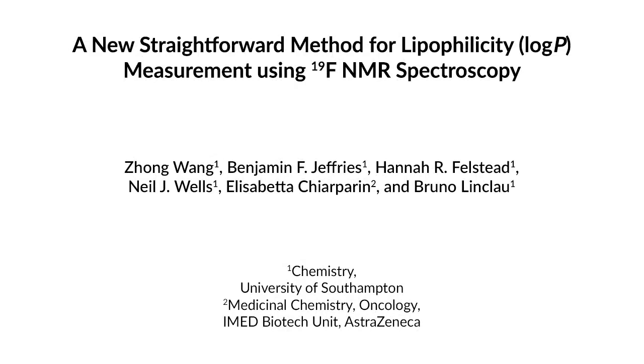We have developed a straightforward method for lipophilicity measurement of fluorinated compounds using fluorine NMR, which is accurate enough to reproducibly measure small differences in lipophilicity. This method can be used to systematically study the impact of fluorination of organic compounds on the resulting lipophilicity changes, which is of interest in general medicinal chemistry.